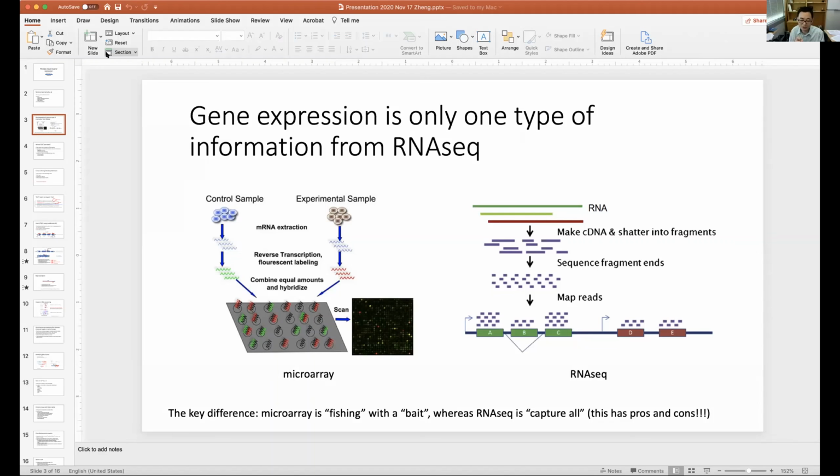But when you look at the gene expression, actually, I don't think RNA-seq brings so much more than microarray, other than it has a bigger dynamic range. I think many of these techniques we use nowadays for RNA-seq actually come from microarray. But the way RNA-seq and microarray give you expression data is that microarray uses fluorescent signals, and RNA-seq gives you the sequence, the short reads.